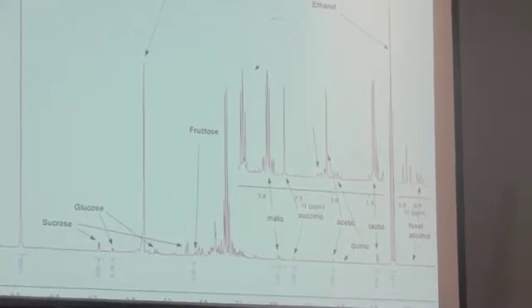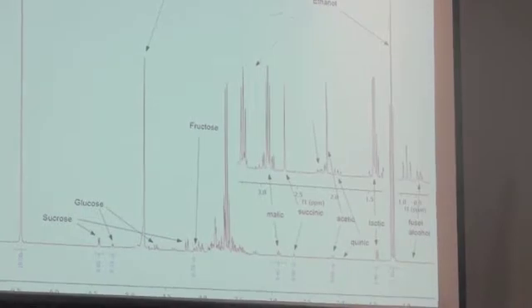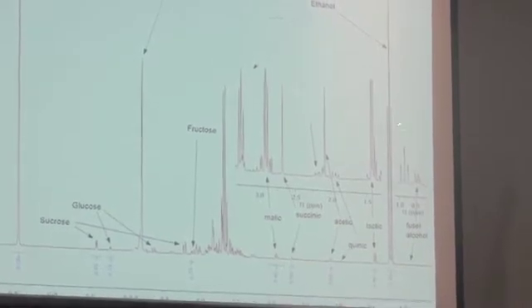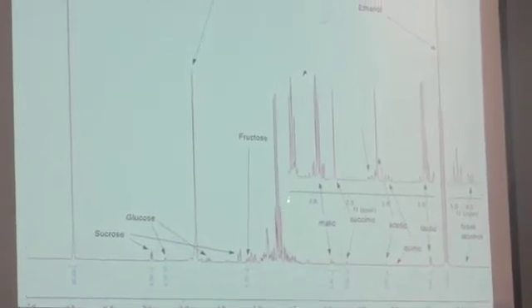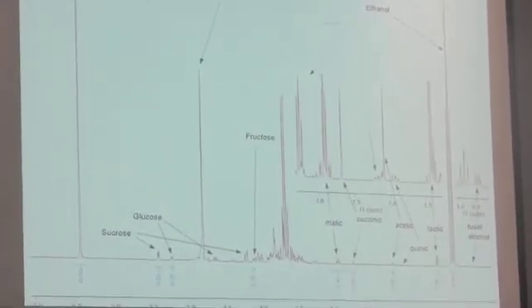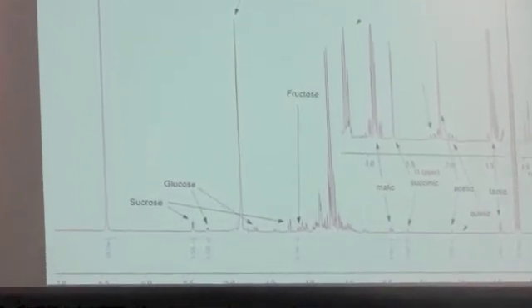So a lot of times you might say, well, is that really that molecule? And you can go look for the other parts of the molecule. So is this really ethanol? I can go over here and say, okay, I can see the 4 peaks of the other part of the ethanol here and confirm it's there. And the other difference is, this is an absolute thing.